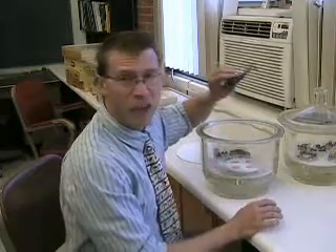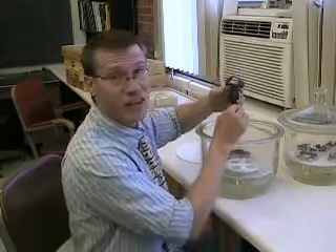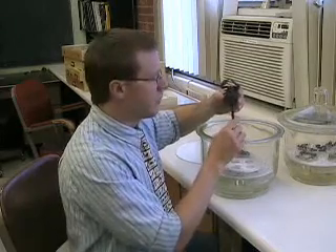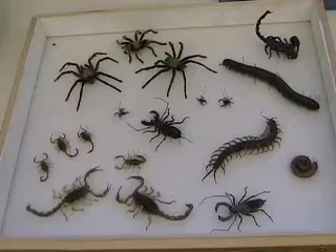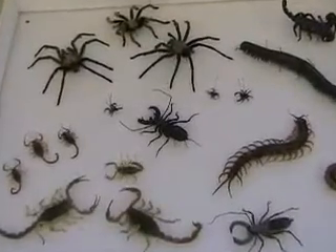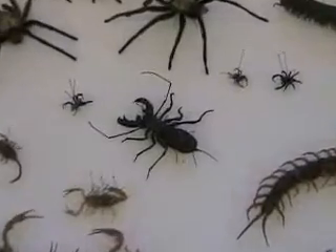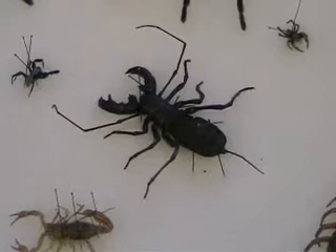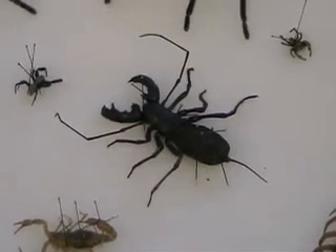Usually, arachnids and other non-insect arthropods go in ethanol — that's the best way to preserve them — but you can mount specimens like this dried if you want to. What I'm trying to do here is soften this specimen so I can spread the legs and claws so it looks nice in a display case. Thank you for joining us.